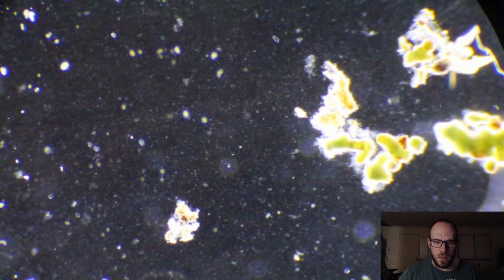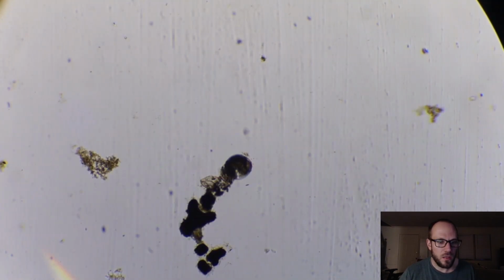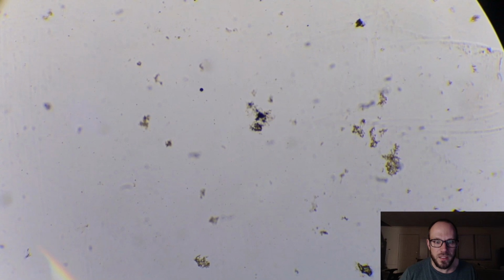So, yeah, I'm actually very surprised at how little I'm seeing on this slide. It's remarkable. Let's go back to Brightfield. We need to start seeing something. Yeah, there's nothing on here. Damn. I'm going to have to do some more looking, but maybe whatever turned the water red killed everything. Maybe it became oxygen starved and suffocated? I'm no expert on this. But I'm just surprised at how little activity there is.